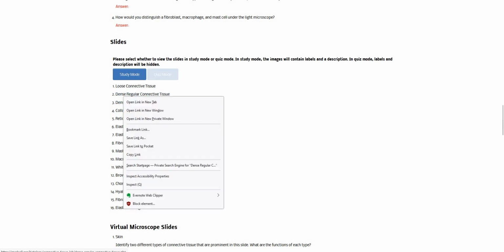So let's try to find both here using our handy dandy histology website. So dense regular connective tissue has a nice patterned appearance to it. It's wave-like. It might be a little squiggly depending on the location of the tissue and how it was prepared, but overall it's going to look like it was combed through. So it's nice and organized.